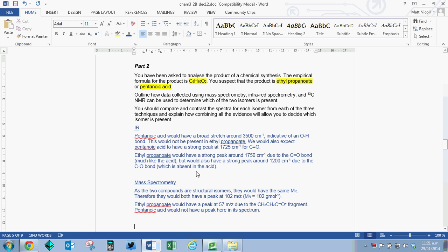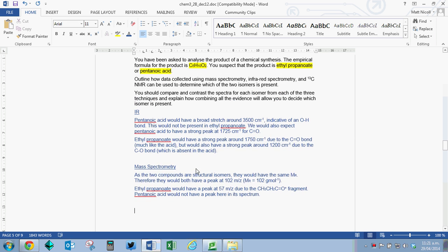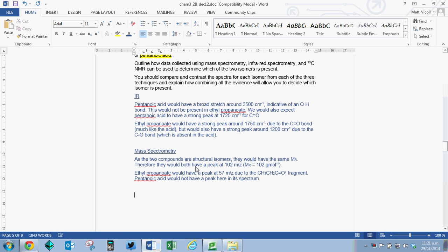I've actually justified why it is, how I'd use this. The last thing I am going to say, and remember I said they both have five unique carbon environments, so I'd probably circle those in my spectra.